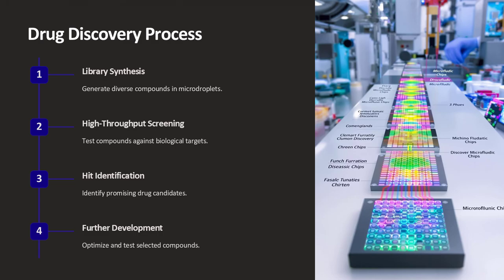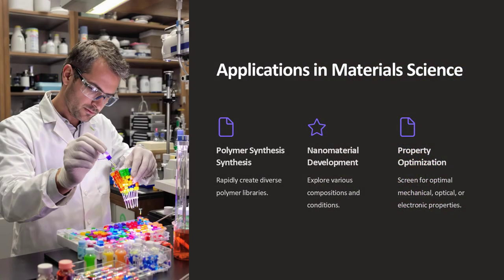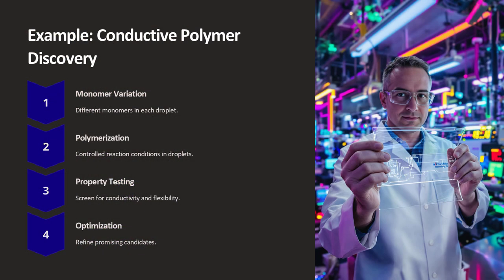One might ask, why is it advantageous to perform combinatorial chemistry in microdroplets compared to bulk reactions? The answer is multifaceted. First, the miniaturization of reactions in microdroplets significantly reduces the volume of reagents needed, which is both cost-effective and environmentally friendly.